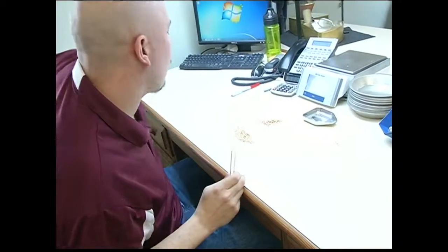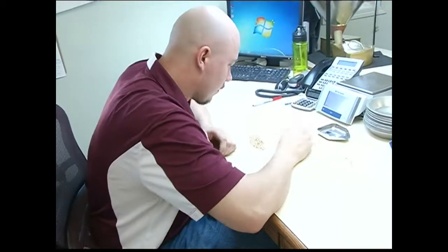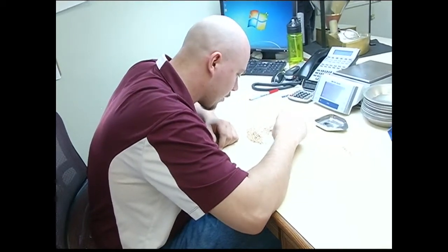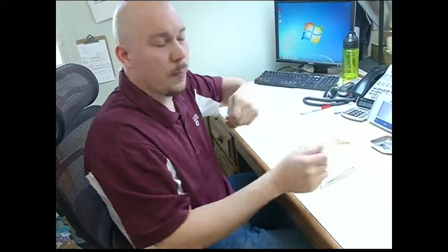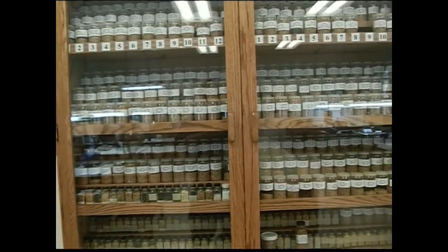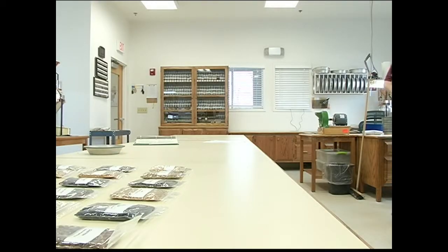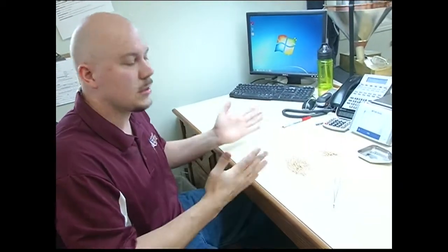This is a winter wheat sample, but I'm also looking to see if there's any spring wheat in there that isn't supposed to be. They like to keep the spring wheat and the winter wheat separate, so we also have to know the difference between the two. We train for that when we take our test, and even as we're sitting here, if we find one that's questionable, we'll pass it around to each inspector and kind of get a consensus of what we think. And we also have a really big library over there with different varieties of wheat samples. So if a farmer calls us and says, no, that's actually all spring wheat, we'll ask for a variety, and then we can compare it to our library to make sure that it's actually what he says it is, and sometimes it is, and sometimes it isn't.